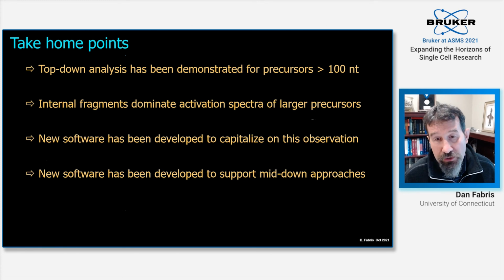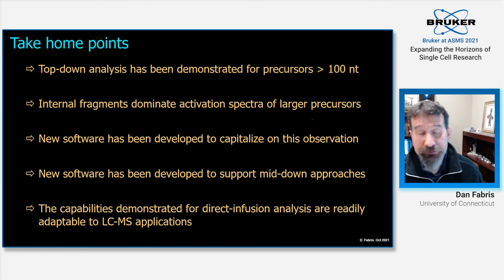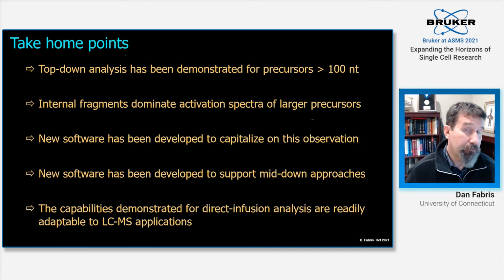Everything that I just showed you was carried out by using direct infusion analysis using static nanospray, but the tools and the concepts are readily adaptable to an LC-MS application. So we believe that there is a lot of value in these types of strategies.